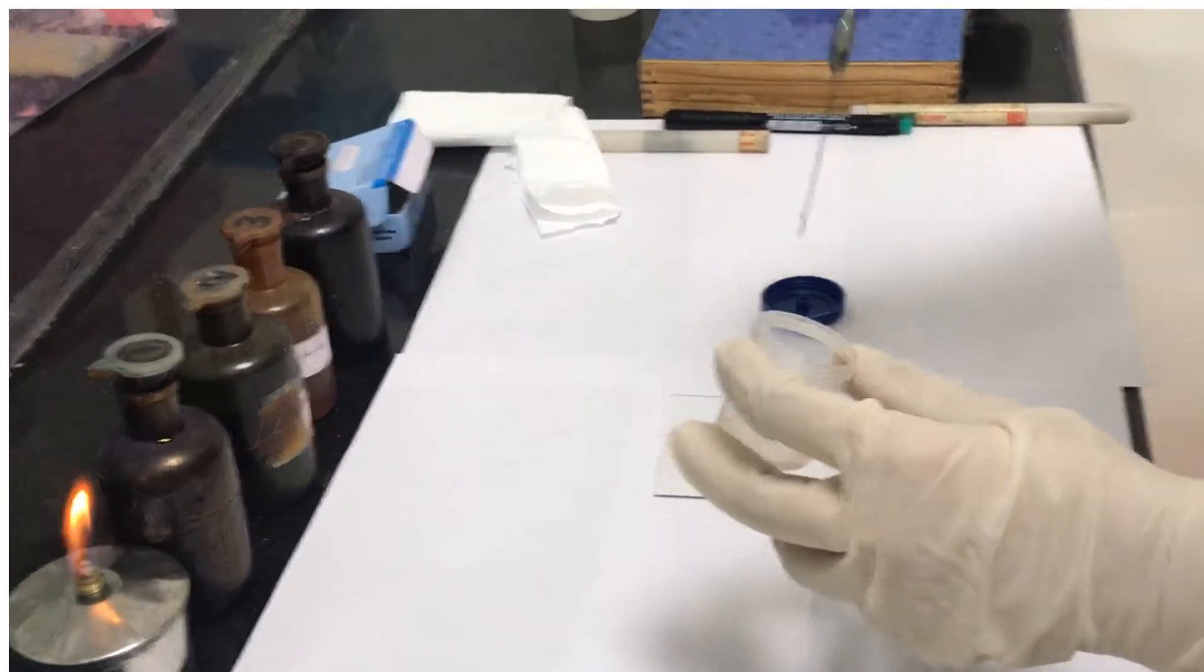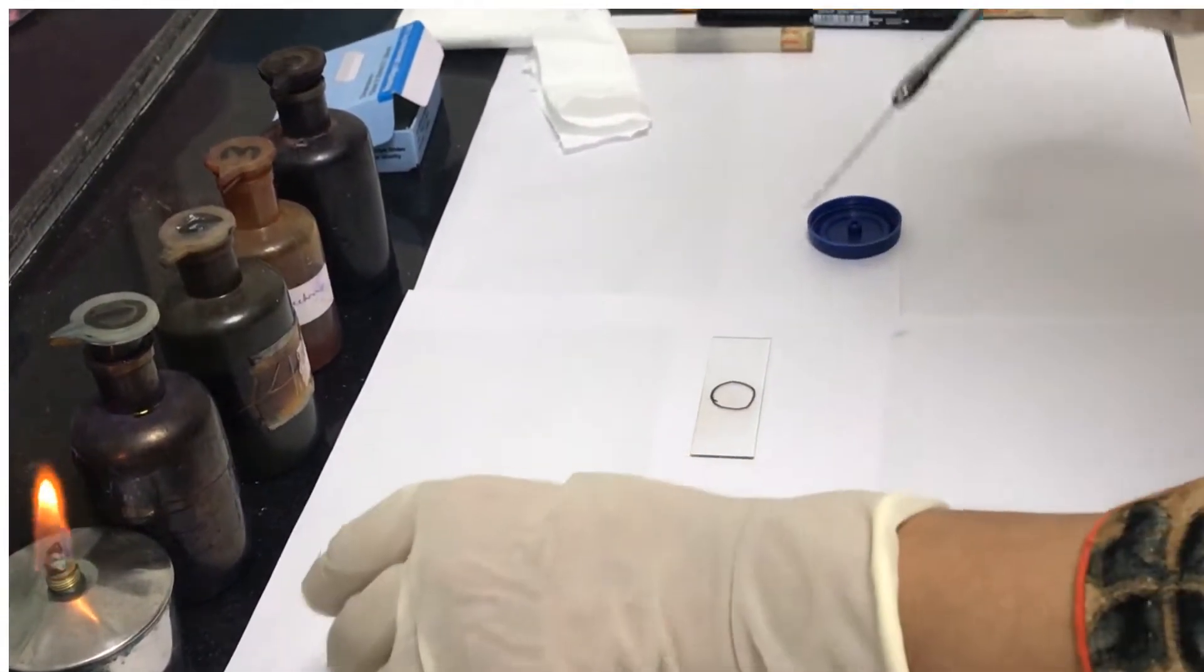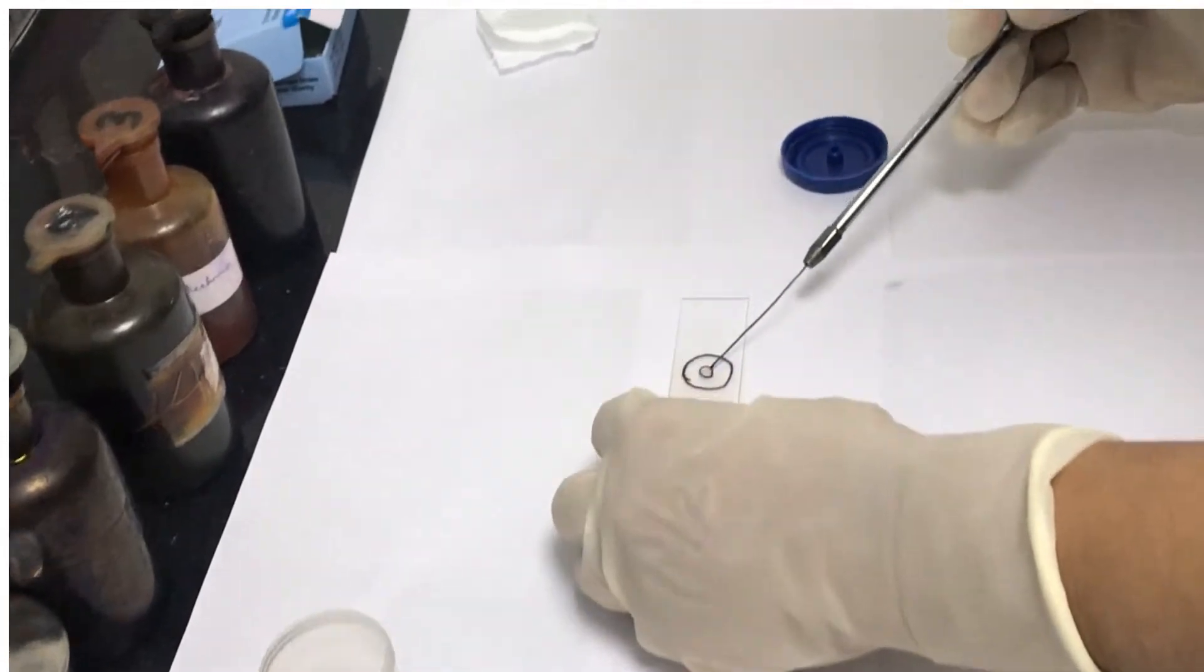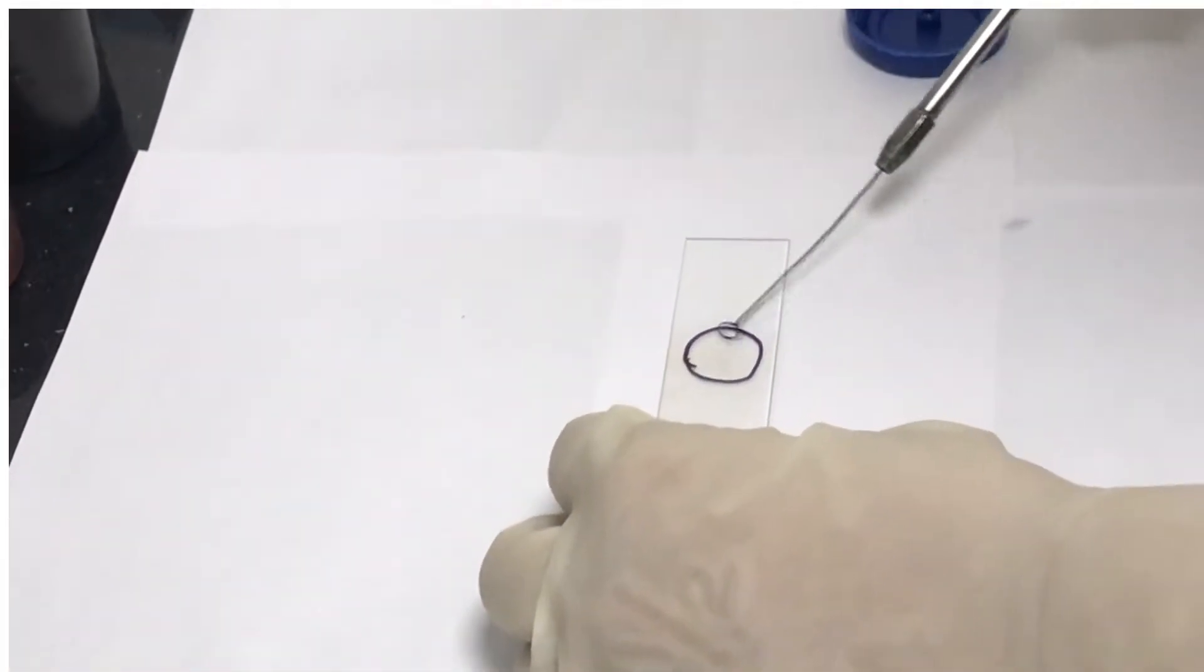With the help of a sterile cool loop, pick up a small amount of bacterial sample and gently stir it into a drop of water on the slide to create an emulsion.